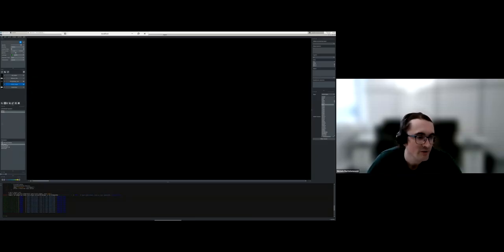And since I have now loaded the SpatialData object, I also have these extra bits, which allow me to choose the coordinate system which I want to explore. And this becomes useful if you have multimodal analysis, like in our case, Xenium plus Comet.